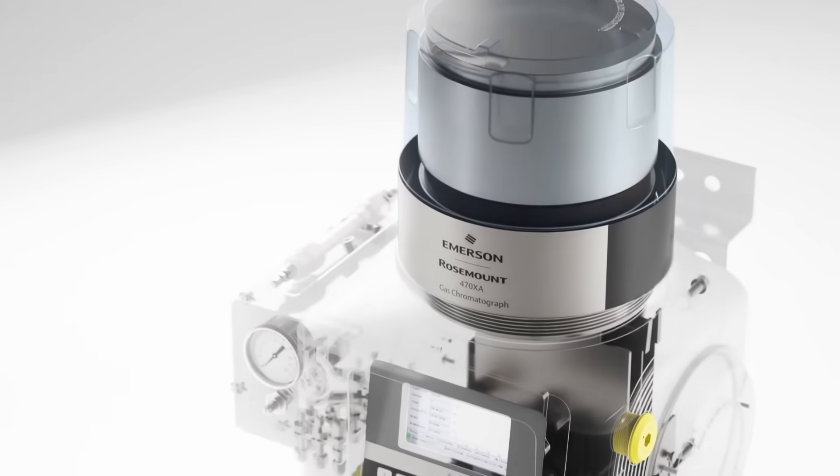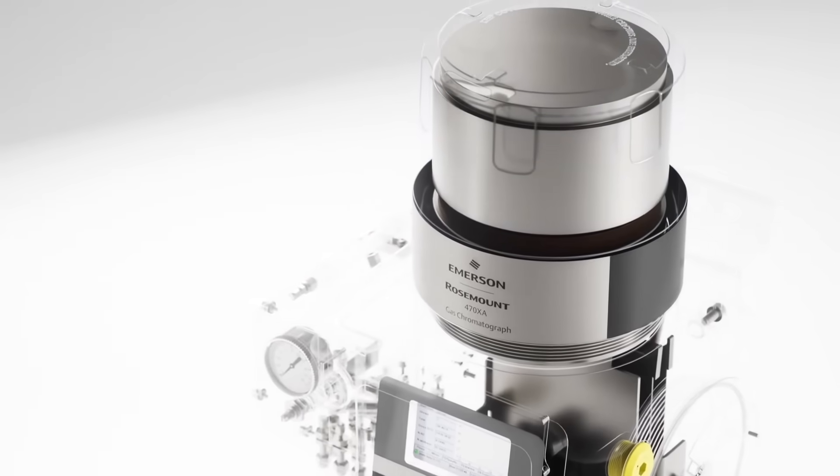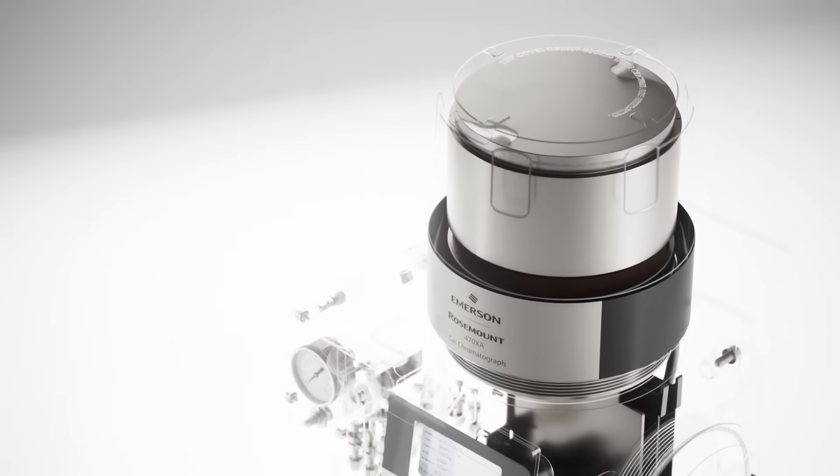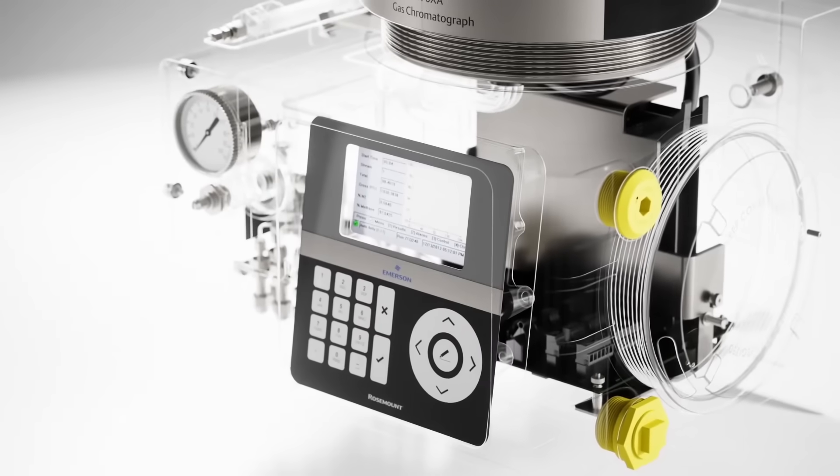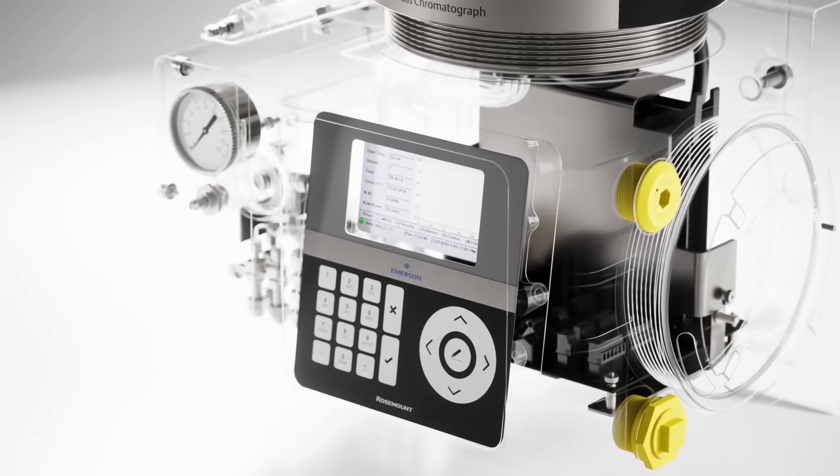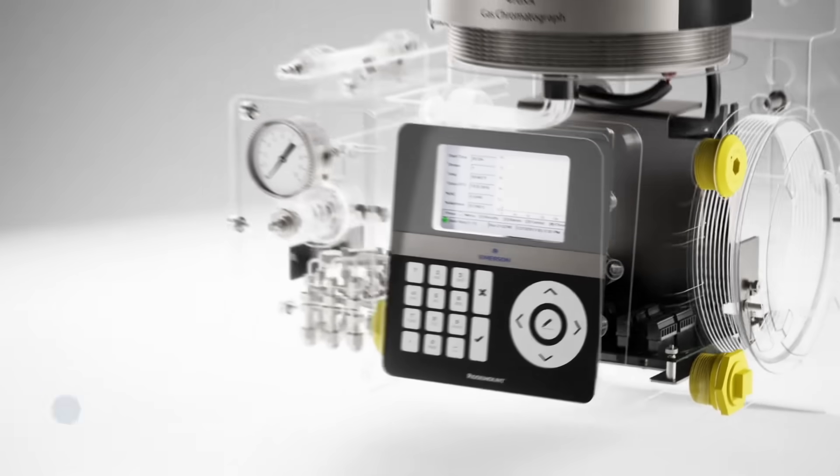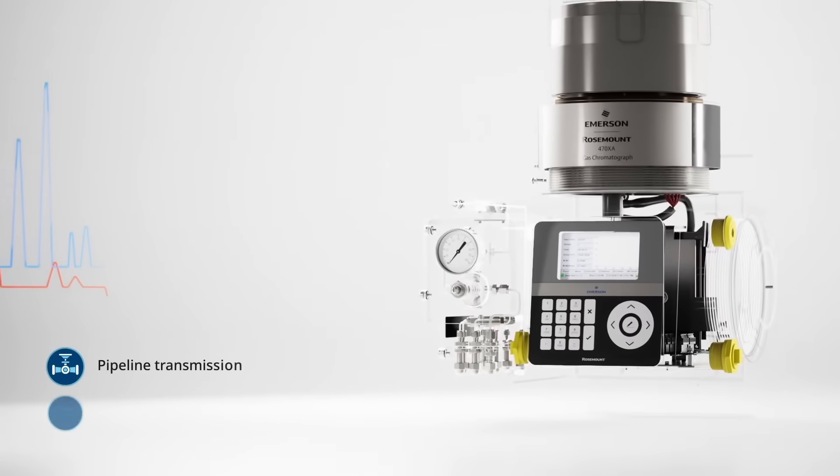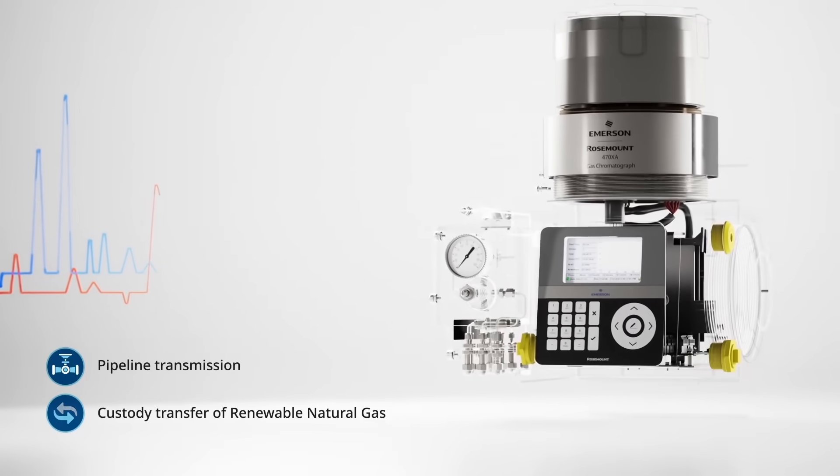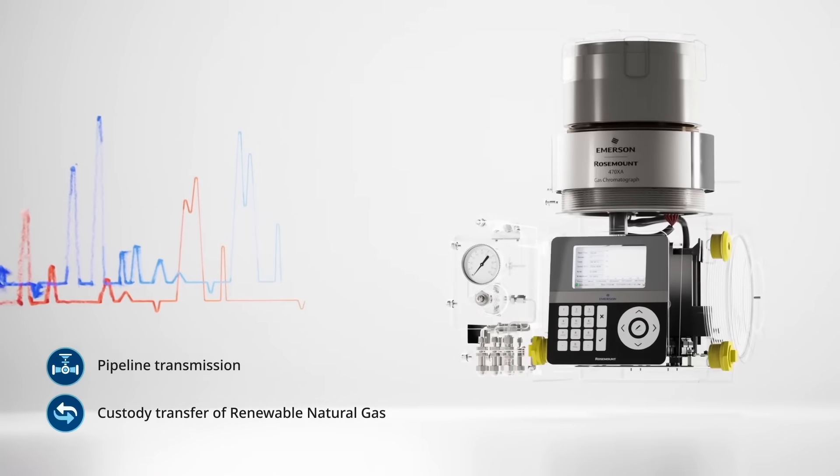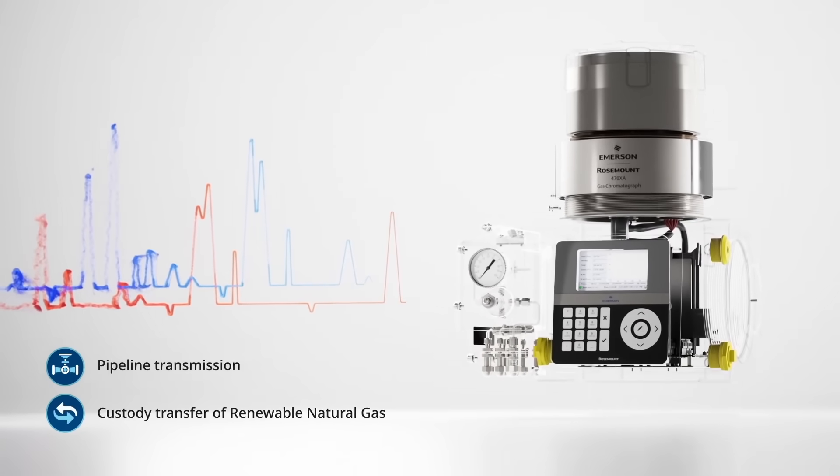With an oven design based on our top-of-the-line Rosemount 770 XA natural gas chromatograph, the 470 XA has the flexibility to support new gas measurement capabilities within the carbon capture and storage market, hydrogen measurements for hydrogen injection in natural gas, low BTU gas applications like biogas generation and transmission, and custody transfer of renewable natural gas products.